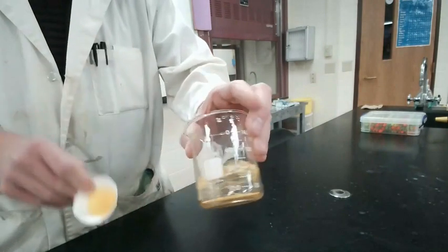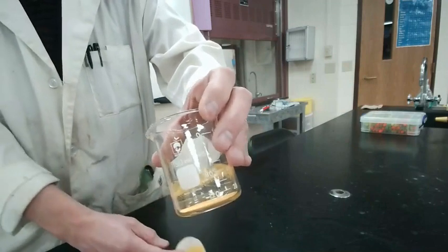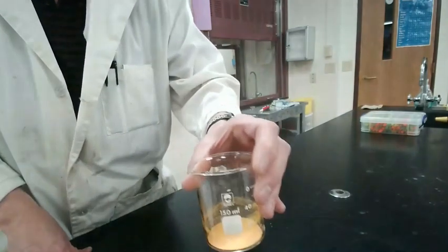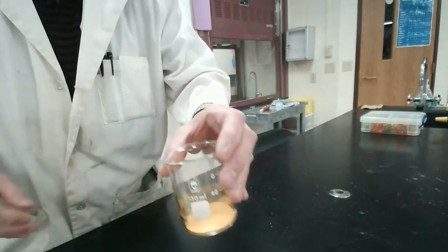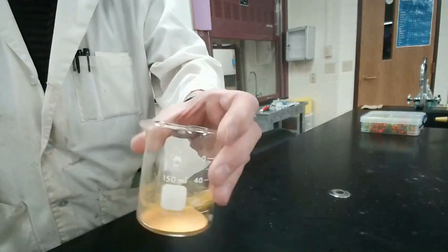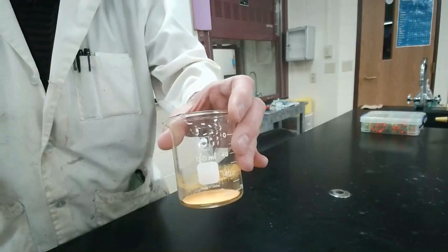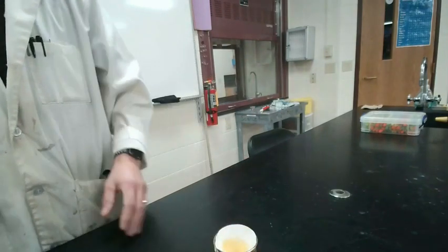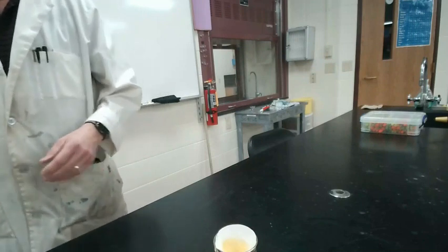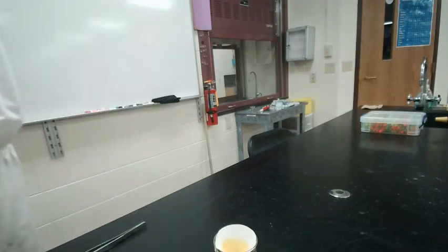Now, again, when you look at it, you can see what it looks like. Okay. No odor from it. Touch it. It feels dusty kind of. Okay. So you should be able to get your observations of this to do the final part of your lab. Make sure you get all your calculations done. Make sure if you have any questions, you see me. But you should now be able to finish the lab as you have all of the information you need from watching this video. Thanks, ladies and gentlemen. Get it done. Get it turned in.